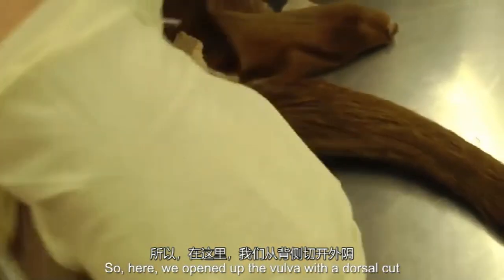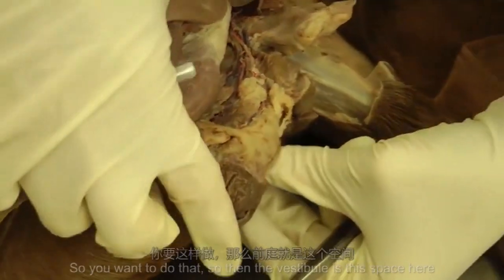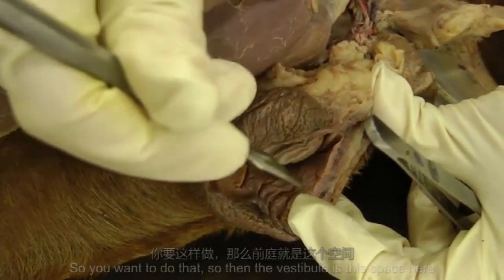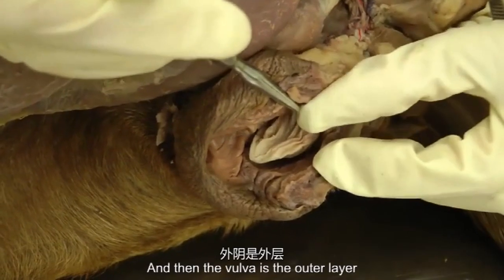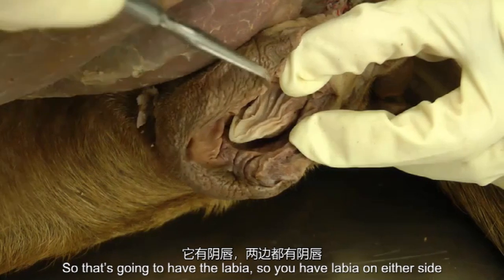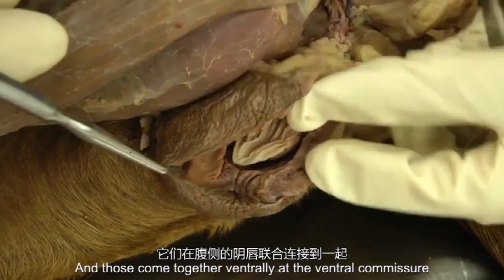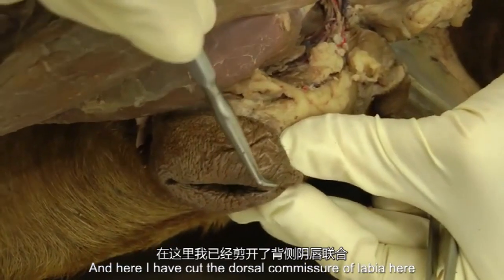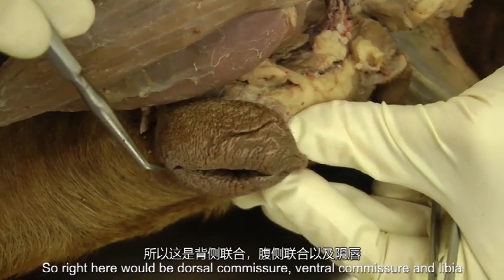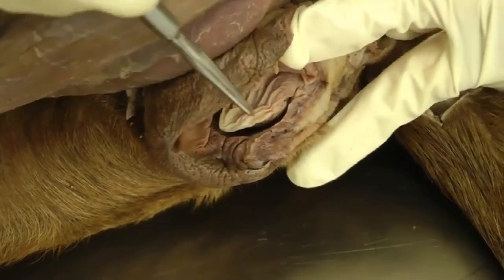So here we opened up the vulva with a dorsal cut, and you want to do that. Then the vestibule is this space here, and the vulva is the outer layer. So that's going to have the labia. You have labia on either side, and those come together ventrally at the ventral commissure, and here I have cut the dorsal commissure of the labia. So right here would be dorsal commissure, ventral commissure, and the labia. That area is the vulva.